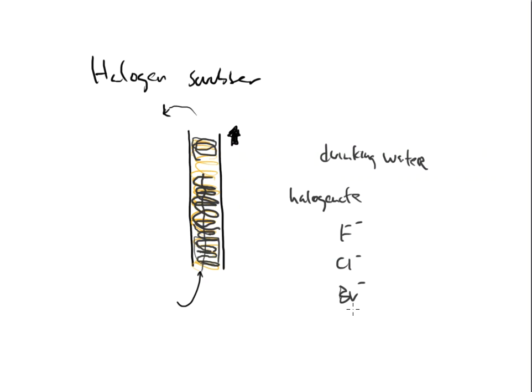Okay, if I was working at CFPUA and I was processing drinking water though, I know I'm going to have these halogens there. I know that they're going to be present, and therefore my scrubber will turn and tarnish. And that's something I constantly want to look for and replace when I can. If not, it's going to cost me a lot of money down the road by the time that I get there, just because I had no clue what the scrubber was doing or why the scrubber was there in the first place or what to look for when the scrubber is concerned. But now you know, and knowing is half the battle, right?